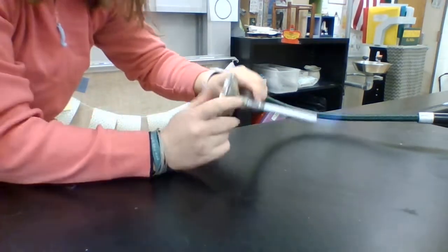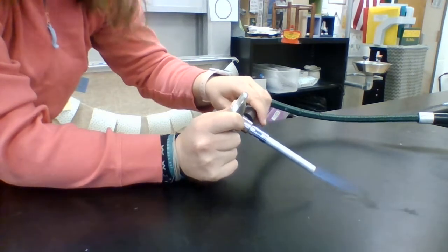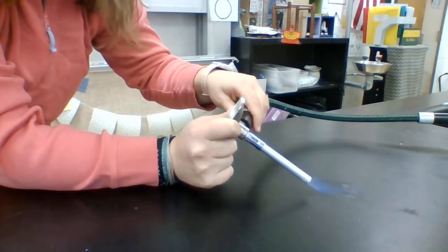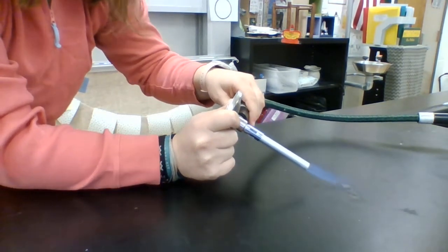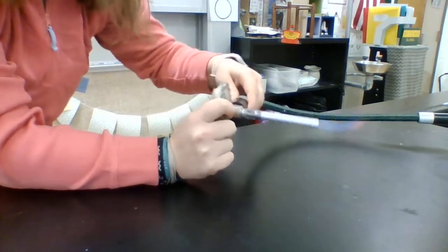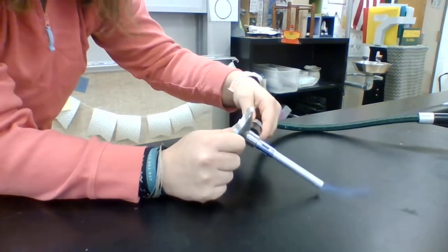This is literally water coming off of the Bunsen burner because water is formed in a combustion reaction. We can prove that there was water present. The gas that's coming off is CO₂, and then the energy is the flame itself coming off of here.